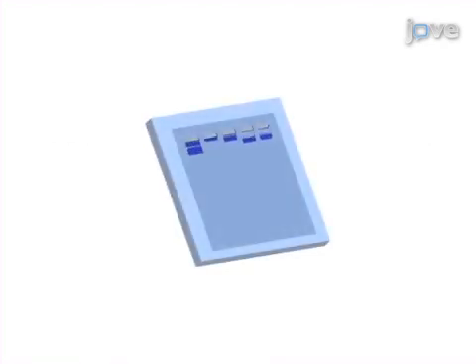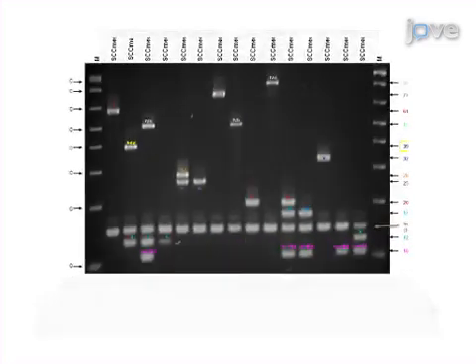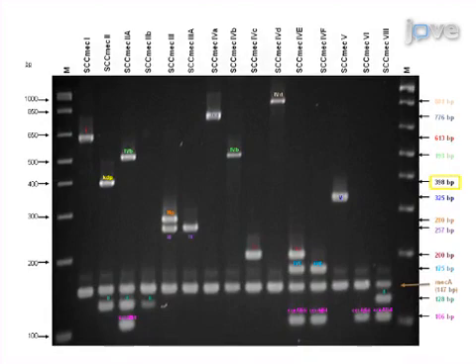Next, the PCR products are separated by agarose gel electrophoresis. The final step is to stain the gel for visualization of the DNA and data analysis. Ultimately, the unique combination of specific PCR products obtained with this multiplex PCR assay is used to determine the SCC-MEC types of the MRSA isolates.